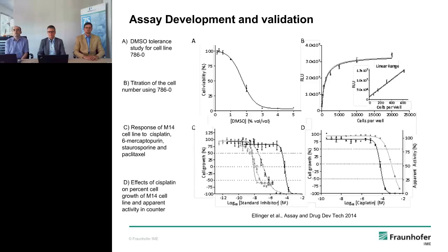I think what is quite interesting and is indicative of this and pretty much any other method is that there's always a potential for compounds to interfere with the detection. So typically within our process, we're able to run a counter assay. And in the counter assay methodology, the idea is that at very short time points, at time 0, you measure the response of the system just to the presence of the compound, and then you can also compare that to the value at 72 hours.